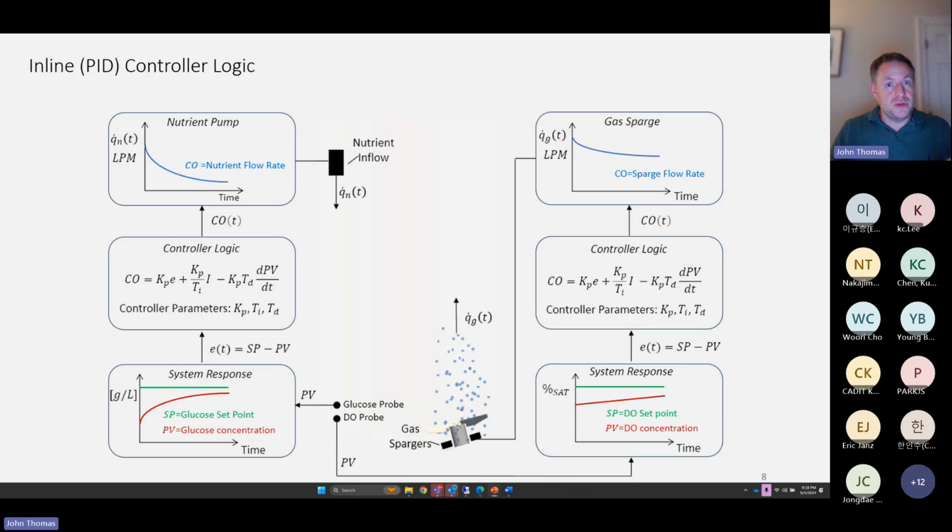With MSTAR and GPUs, we can model hours of process mechanics and see the combined effect of glucose addition, the bioreactions, glucose probe measurements, and the effect that has on system outcome. So importantly, we're integrating process control into the simulation.